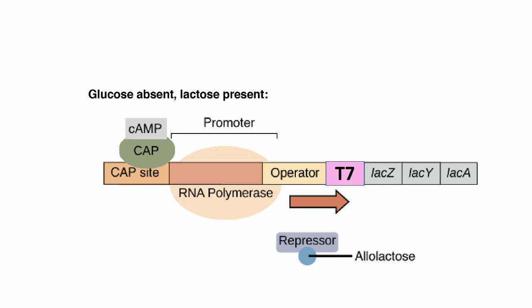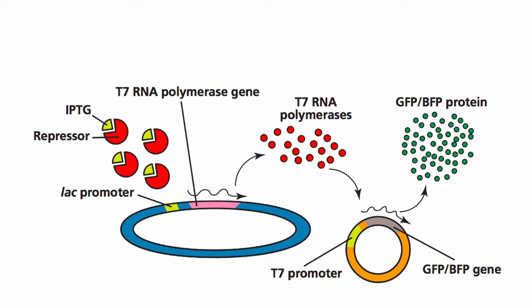So why do we need to know that? Why do we need this T7 RNA polymerase? It's actually how we're going to get the protein from our plasmid. So this is how the mechanism is working. We're trying to get these T7 RNA polymerases from the gene of the E. coli cell. And in our plasmid, our promoter region is actually specific to the T7 RNA polymerase.